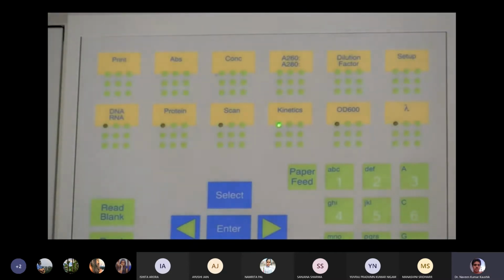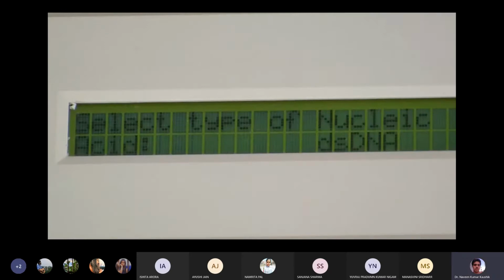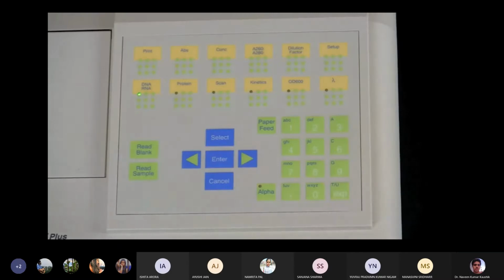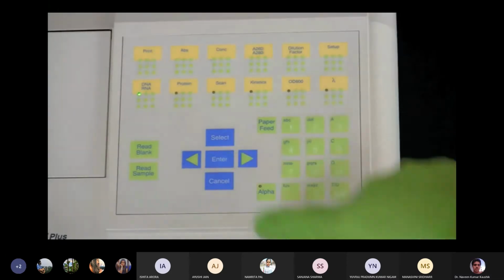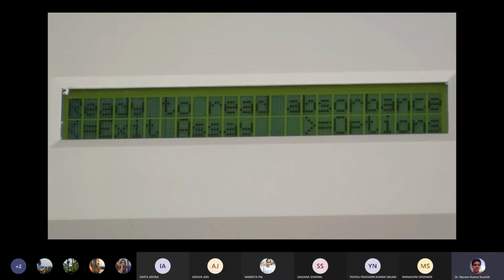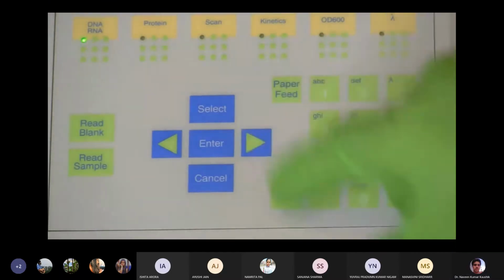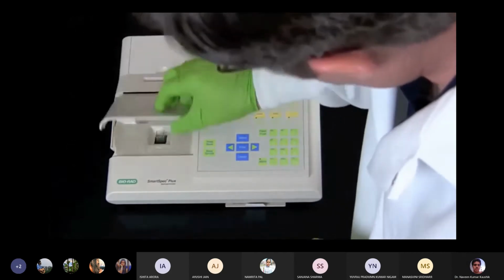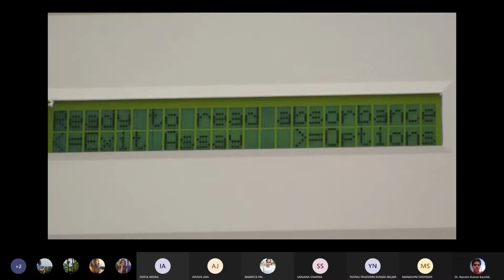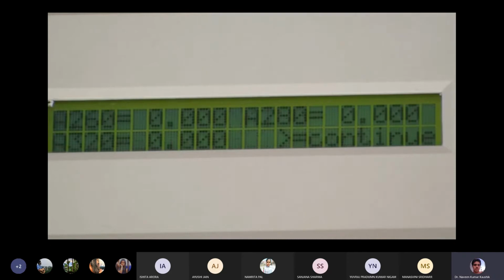Set the spectrophotometer to its DNA quantification setting. Your screen should show that you have selected for DNA. Press the Enter button. Press the Enter button. The display screen should now show that you are ready to read absorbance. Press the right arrow button. Insert the control cuvette, making sure the correct side is facing forward. Press the Read Blank button. After completing this process, the screen should read 0 absorbance.